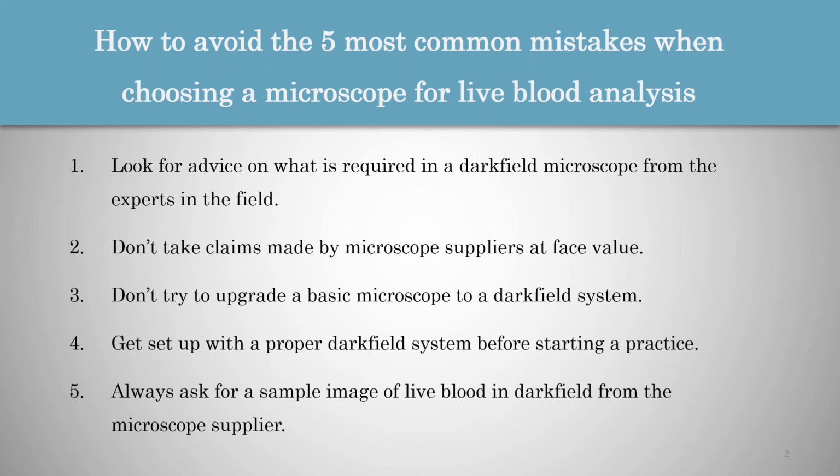Unfortunately, no shortcuts. A basic microscope will allow you to practice taking blood samples and looking at them in bright field, but you won't really be able to do any type of dark field microscopy with it. So that's something that you would have to then learn once you actually get a proper dark field system. So for the learning process, it's just much easier to actually get set up with a good system from the beginning.